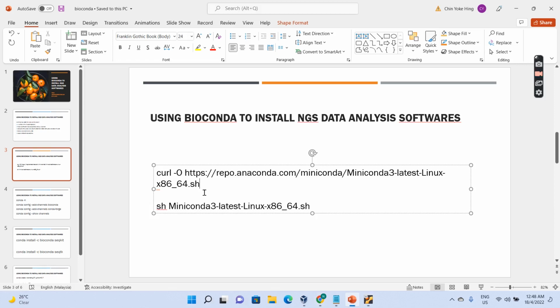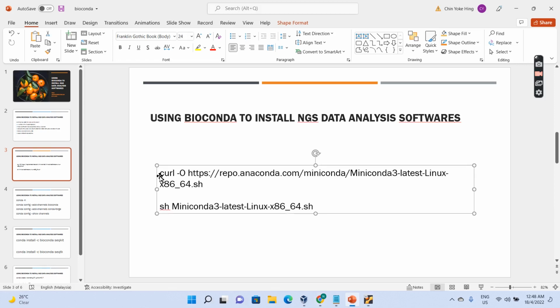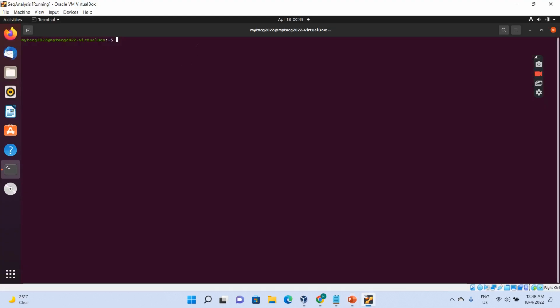I try to copy again. Then run. This might take some time.